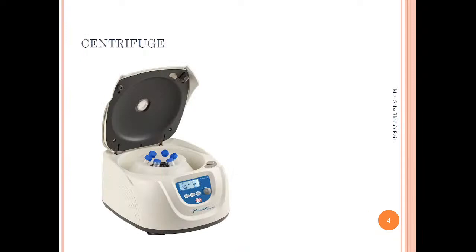Now see, the first centrifuge machine was made to separate cream, not the blood sample or anything else. The credit for making the first official centrifuge machine goes to Gustav de Laval.